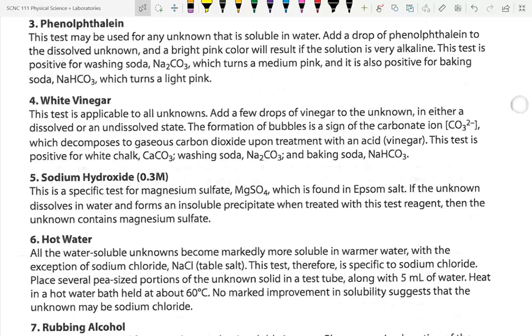Phenolphthalein being this one here. Notice that it says it's 95% ethanol or 190 proof if you were going to talk about liquor. It's highly flammable. Obviously, you don't want to drink it. Just because it's 190 proof does not mean that it would be a good liquor at all, because that phenolphthalein, I believe, would make you sick. So, we don't need bad ideas.